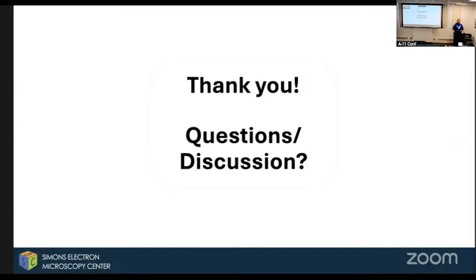How many classes? This was quite a bit. We're really trying to filter out junk in this for a different project, but it was 50 to 100 classes, up to 500 even. So a lot of classes.